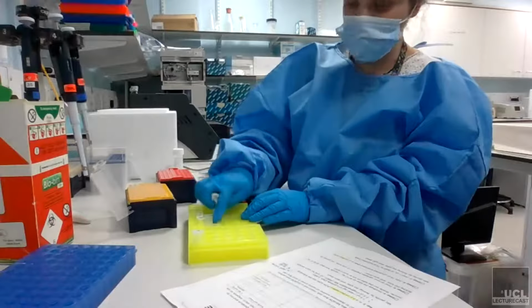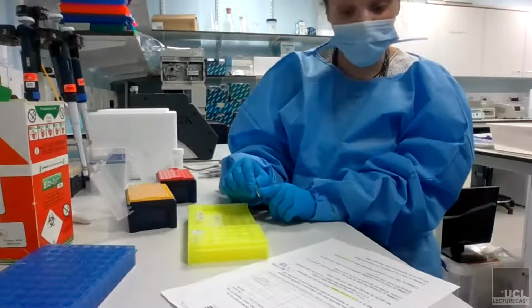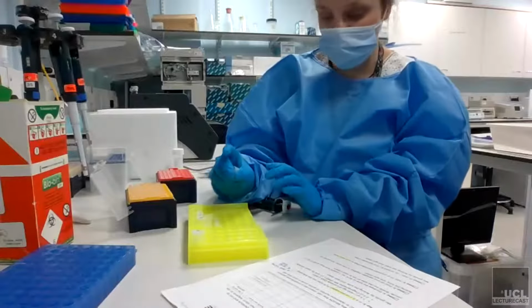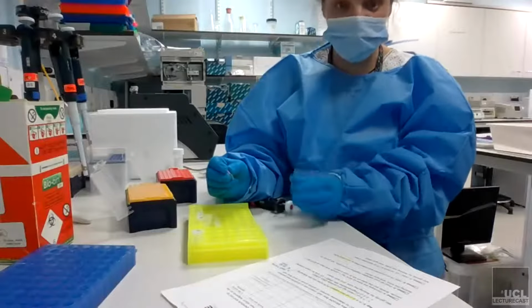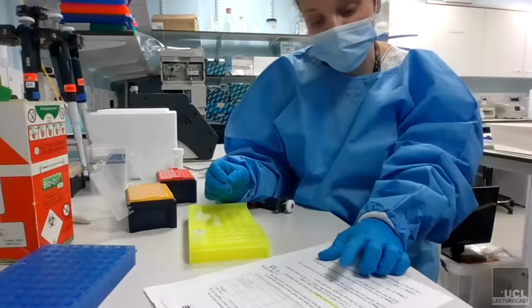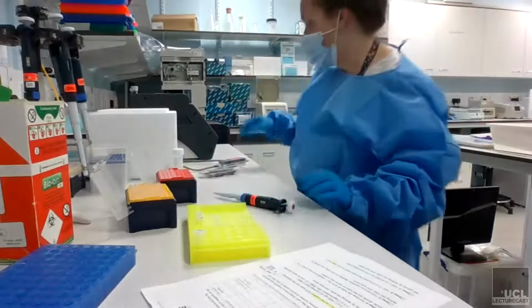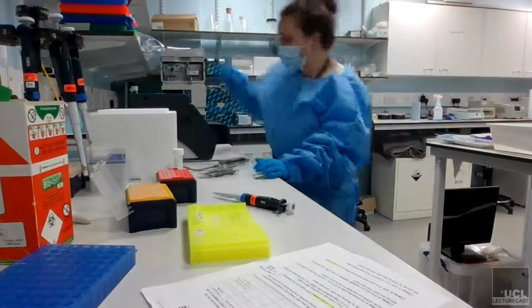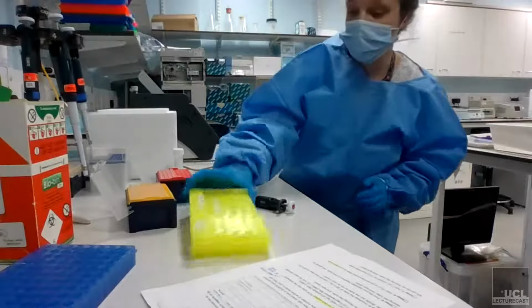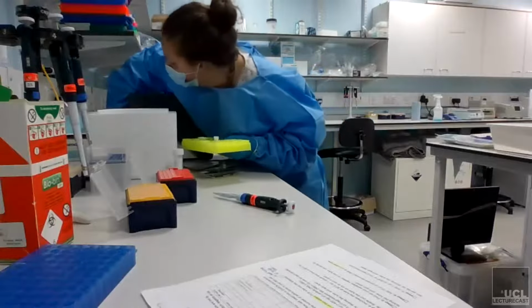So now what you have in each of these tubes is a mix of your sample and also the barcodes. Now what we need to do now, this is when we're going to use the PCR machine or the heat block, is basically kind of stick the barcode to the DNA. And so as it says in the protocol, you incubate the tube at 30 degrees for 1 minute and then at 80 degrees for 1 minute. So as I said, because I do this quite a lot, I've already got a program on my PCR machine. So I'm going to incubate mine in the PCR machine. You can incubate yours, as I say, on a heat block.